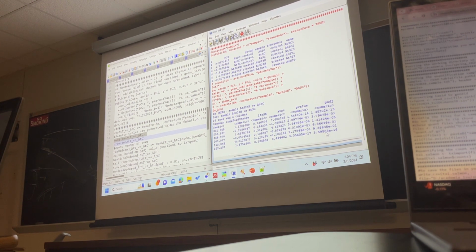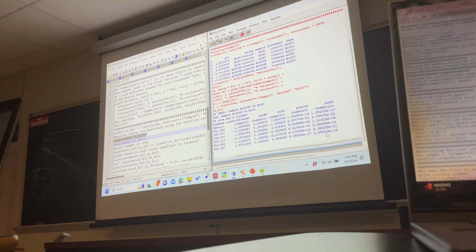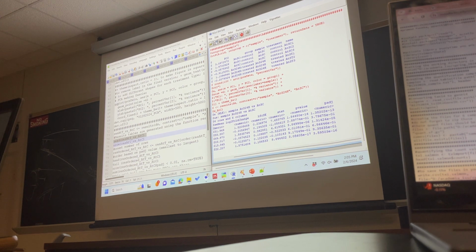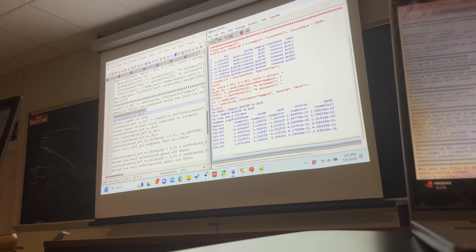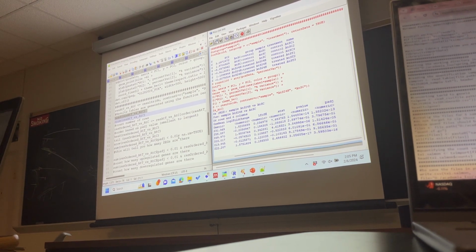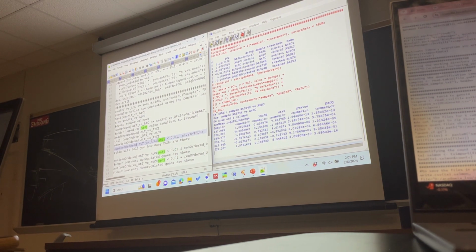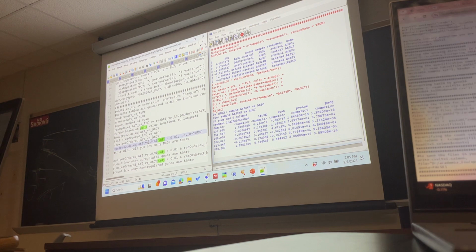So can you repeat that? So this is the cutoff. When do you decide what the cutoff is? Right now we haven't decided any cutoff. In the following few commands, maybe it will be there. So I asked it to consider the adjusted p-value less than 0.01 as a DEG there.